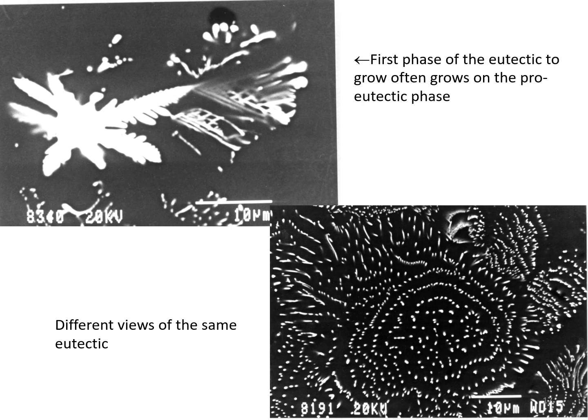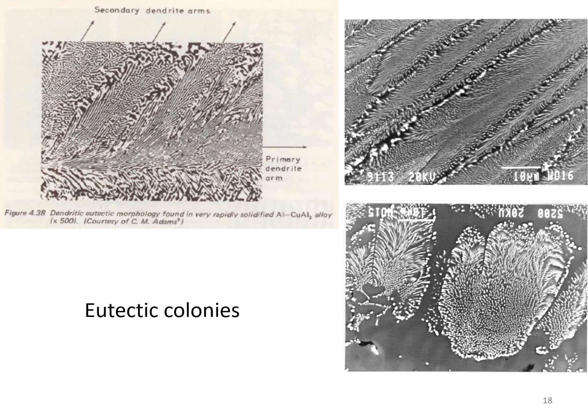And this is looking at the same thing, and it's just purely by chance how we sectioned it and prepared it. You can actually see the eutectic growing off the tip of that dendrite here and here. And if you could imagine standing over here and looking back at it, you'd see these lovely cones being formed. Complete fluke we got that, but very nice.